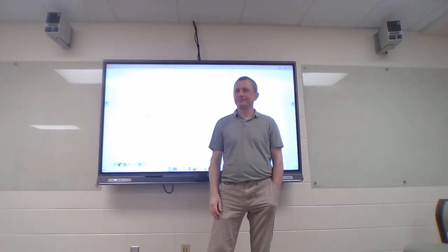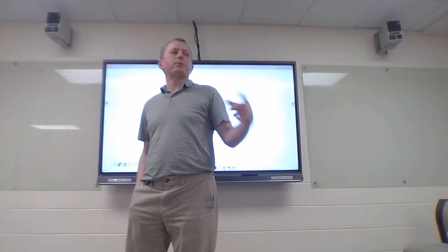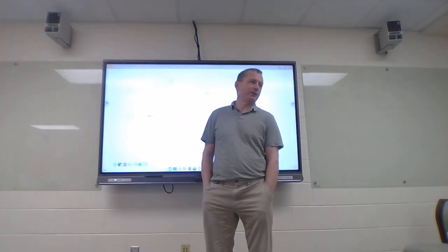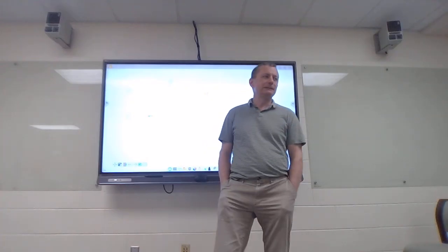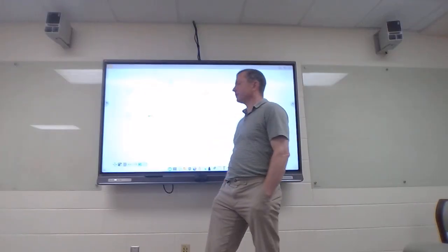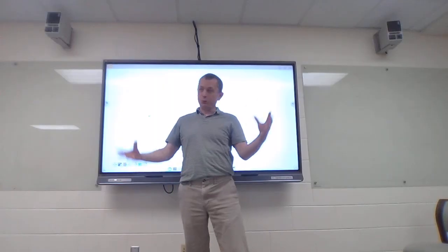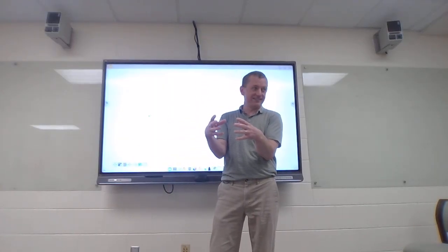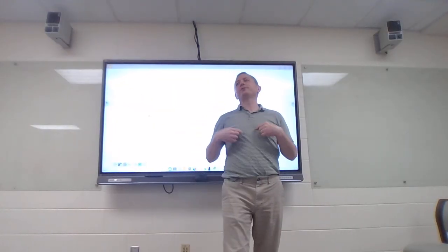Do we get IRs with it? All these would probably get IRs. There may be a few examples of experiments we run where we don't take an IR, but you'll have a melting point or a TLC or the GC mass spec. I don't ever look at an IR and just say, oh yeah, it's this one. Hey, listen, the other thing about NMR is it's not coming in a vacuum. You know what reagents you used. So the things you started with are probably going to be in the end. And oftentimes I will give you an NMR of the starting material for comparison. All right? Cool.